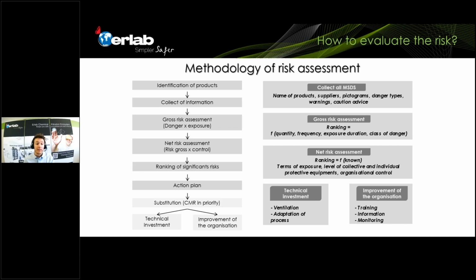And then, when you make that action plan, you have two different possibilities, and that's what we're going to talk about in the next slides. You can make a technical investment, so a safety solution in terms of enclosure products, and you can improve your organizational methodologies. Very important: what is the thing that we can do immediately, straight away, let's say tomorrow? It would be the improvement of the organization.